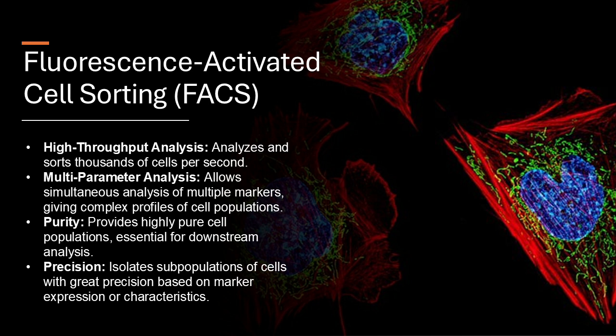It seems like we hear about a new breakthrough every day. What are some of the recent advances that have really changed FACS technology? One exciting area is spectral flow cytometry. Spectral flow cytometry. Right. This technique uses multiple lasers and detectors to capture a wider spectrum of that fluorescent light, so researchers can analyze more markers on a single cell.